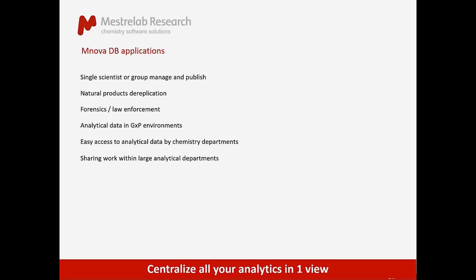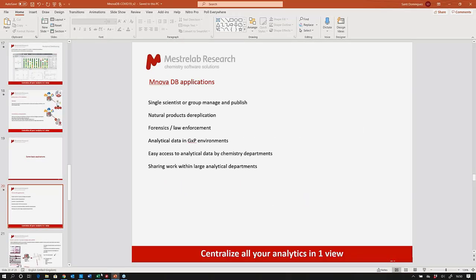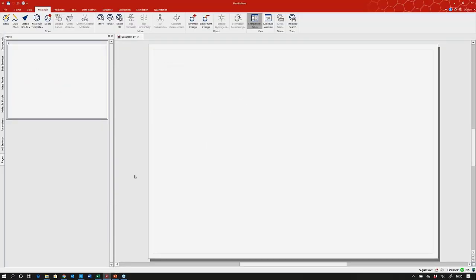Okay, so this is a little bit of the basis and some of the things that you can achieve with the database, which is great, but I think it's more interesting to actually look at the tool. Okay, so now we are going to move to Mnova. And what I'm going to do is I'm going to open my Mnova, which hopefully everybody can see now.